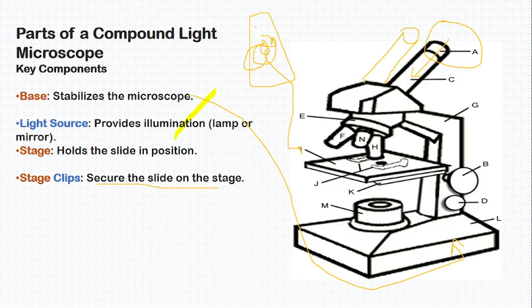Once you put your slide on a light microscope, you should place it in position so that it cannot move.